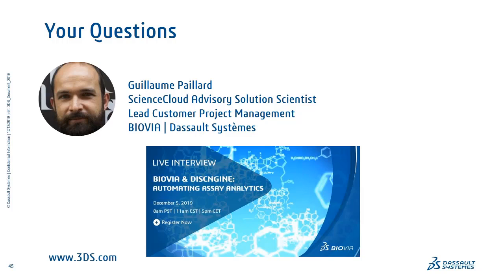Now, in any case, as I said before, assay is very open to extension and customization. So as long as the level of complexity in the way we handle data can fit with your new type of assay, I'm sure there are ways to accommodate it, either to create yourself or to work with us to create new normalizations, new calculations to handle those types of assay.